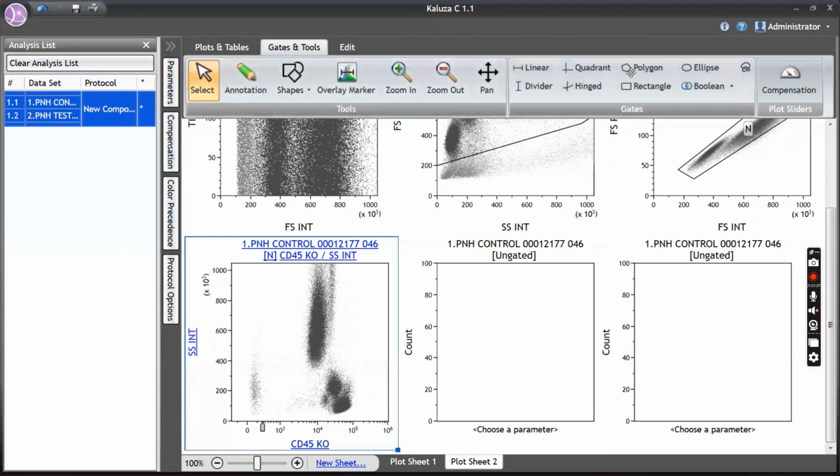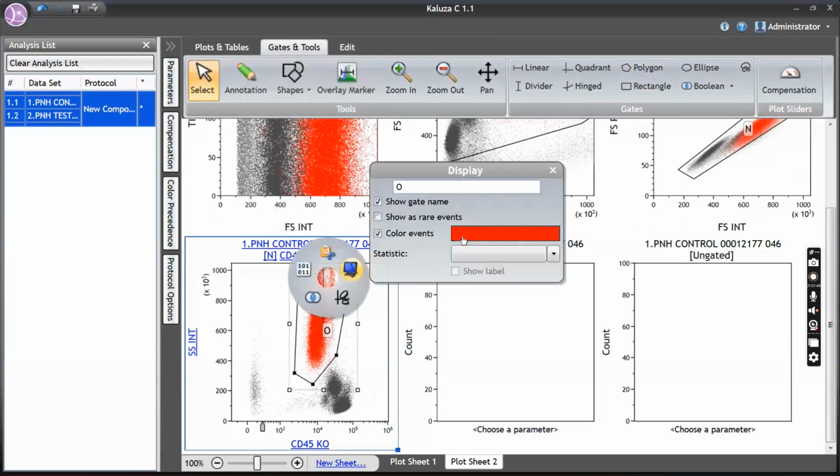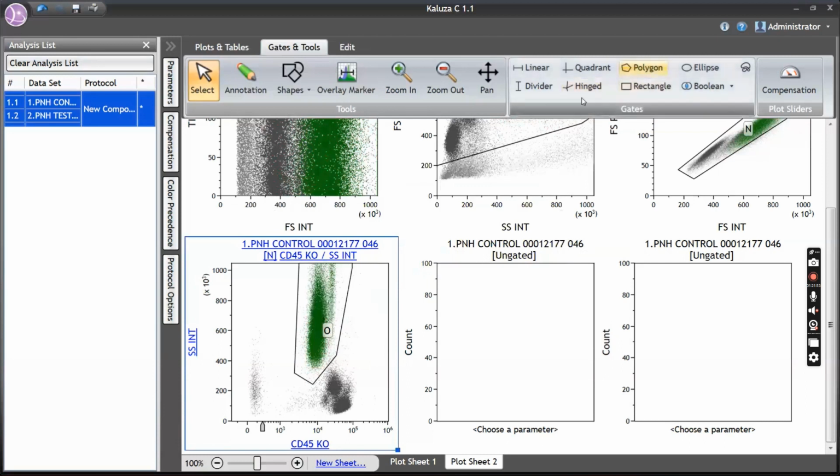Now what I'm going to do? My interest is neutrophils and monocytes. So first I'll take the population which is showing high side scatter and CD45 moderate. This is likely to be neutrophils, and then I'm going to select monocytes. When you're drawing a gate, always be generous. Don't be very stringent when gating the monocytes. Be generous because you also have a gating marker, so there you can eliminate the non-monocyte population. I'm including a bit of basophils also.